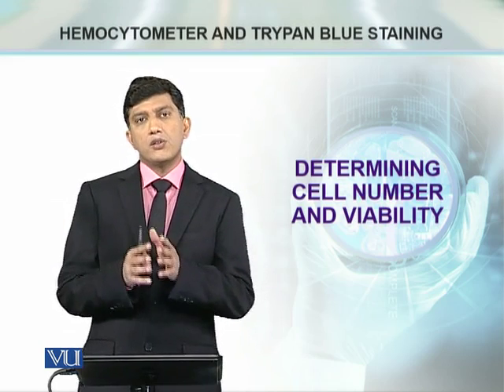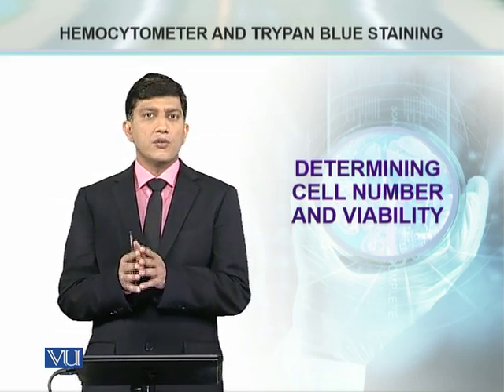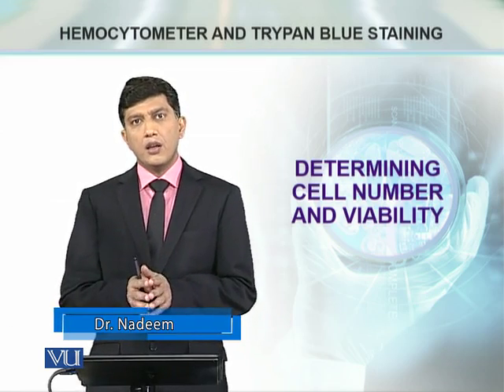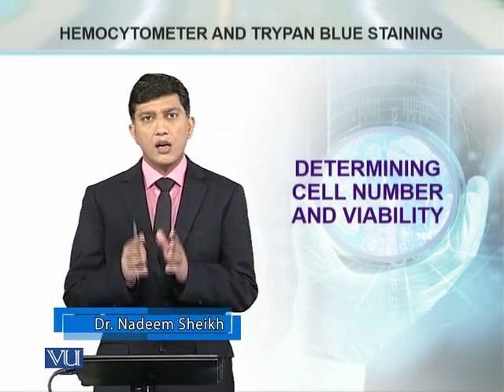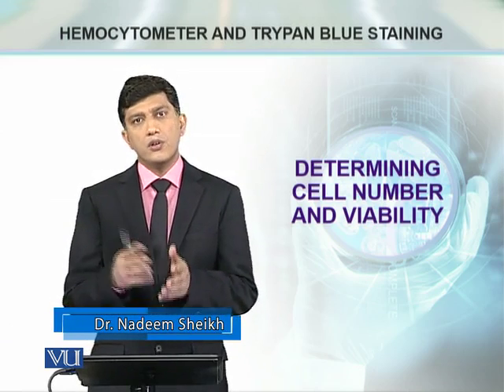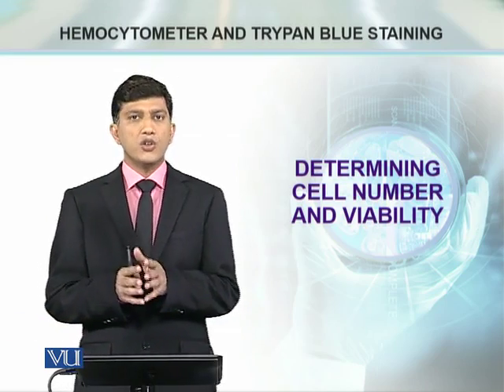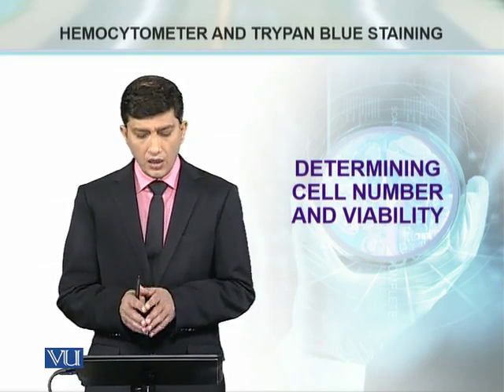जब भी हम सेल कल्चर में से फ्रोजन सेल्स को थॉ करने की तरफ जाएंगे, देन वी हैव टू इंश्योर दैट व्हाट पॉपुलेशन ऑफ सेल्स आर स्टिल अलाइव एंड व्हाट पॉपुलेशन is no more alive. For that purpose, using hemocytometer, we perform cell count.